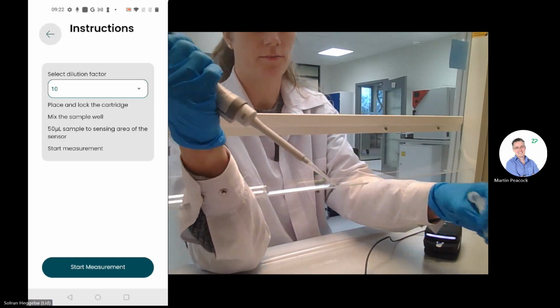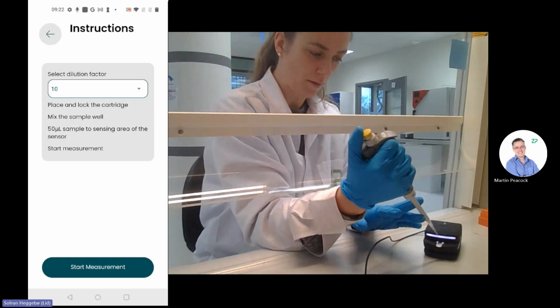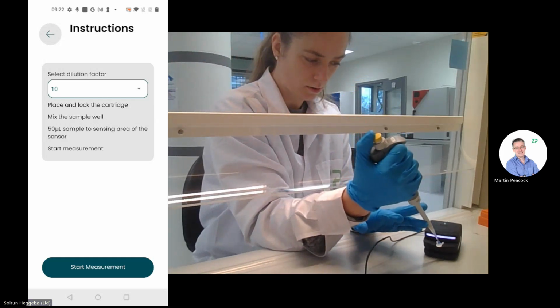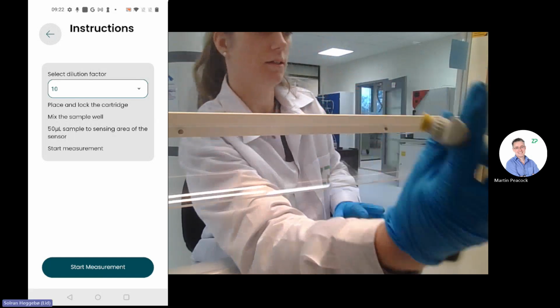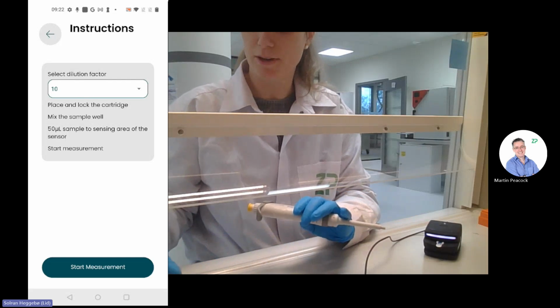Like that. And then I will pipette it onto the sensor. Just like this. And then I will click start measurements.